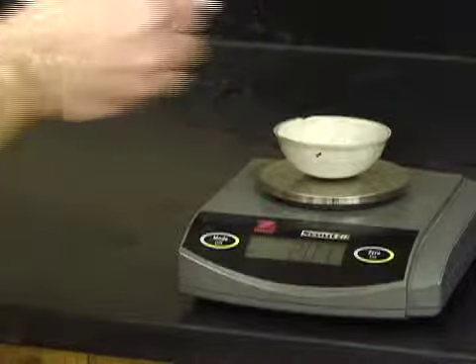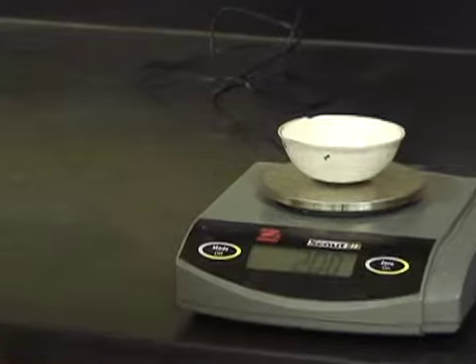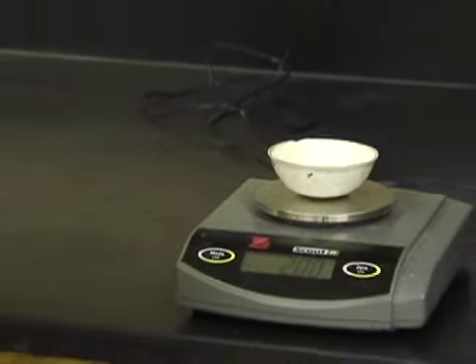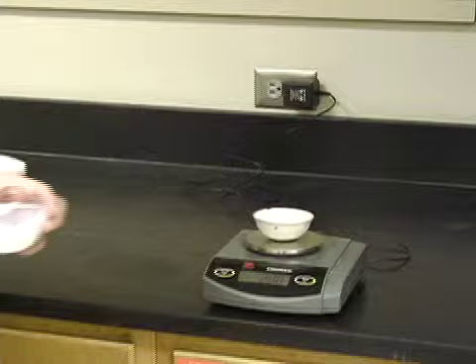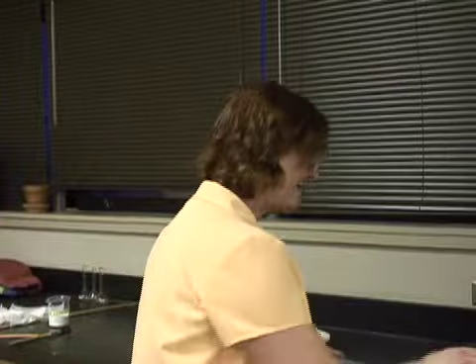I want it to stay at 2.00. 2.00 grams of my hydrated crystal. Now you need to look in the objectives to find out exactly what this crystal is. I have 2.00 grams of my hydrated crystal.